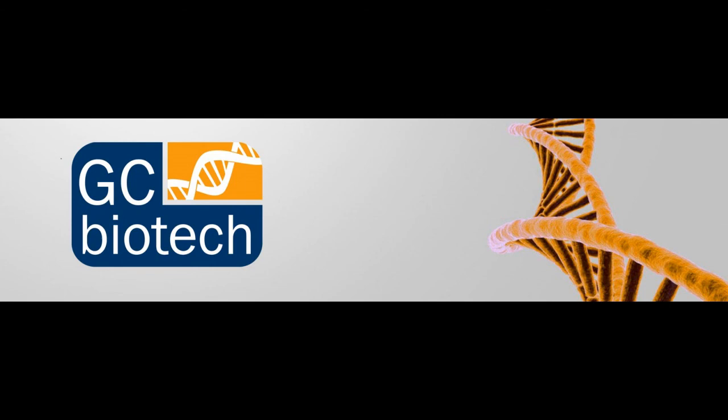But you could theoretically take that microliter off the UV vis pedestal and add that to a fluorescence measurement. The other option is that you can use even smaller quantities on the UV vis side, but you just have to be very careful with your pipetting to make sure that the sample is actually deposited onto the surface.